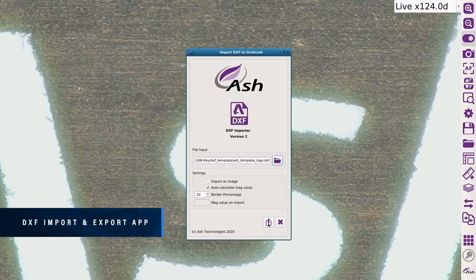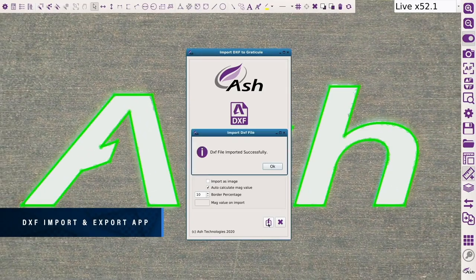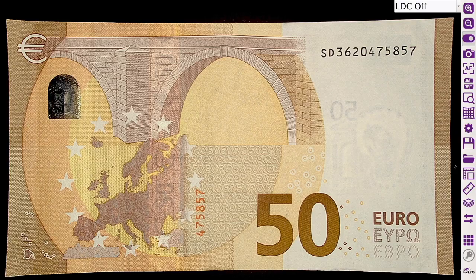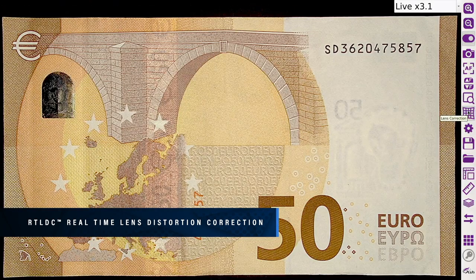Import and export DXF files from a CAD package to create reticles for overlay comparison with parts. Compare your manufactured parts to DXF files in a matter of seconds. The Omni 3 incorporates unique real-time lens distortion correction, utilizing the new AshCam Plus, allowing inspection of a true, undistorted representation of your sample.